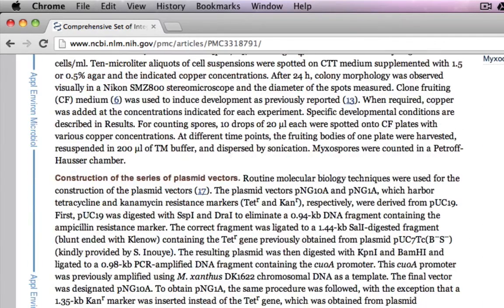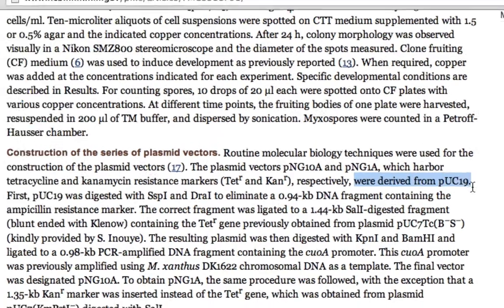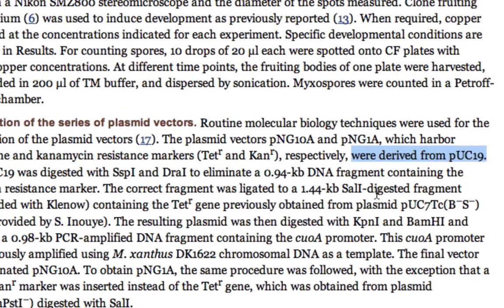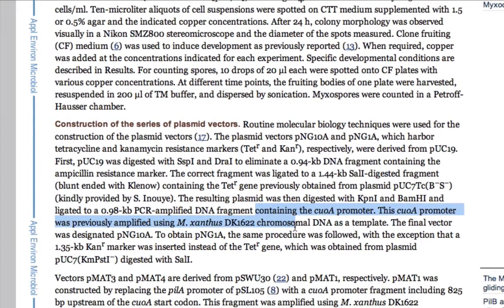Here it is: construction of series of plasmid vectors. Just by a cursory glance you can see that the vector is derived from pUC19 and it has a cuoA promoter which is a copper inducible promoter.